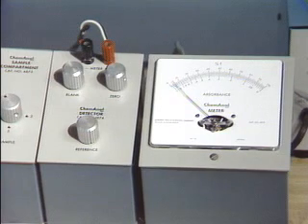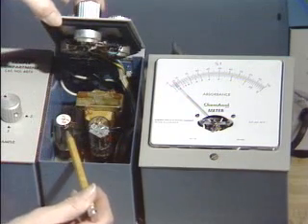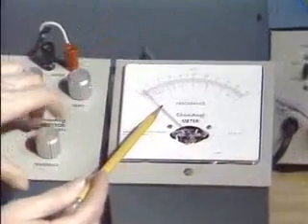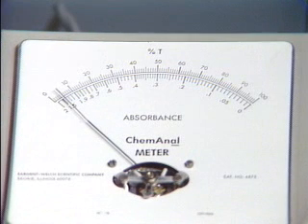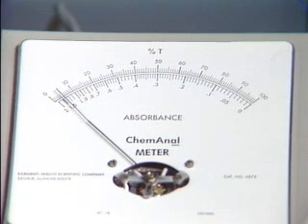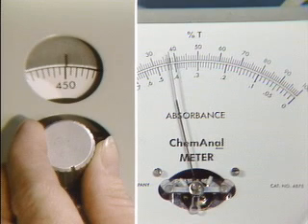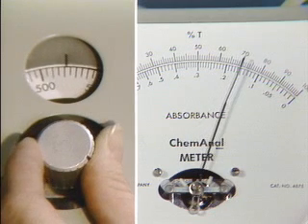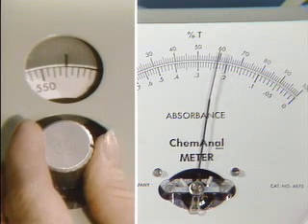The photometer portion of the spectrophotometer consists of a phototube which detects the transmitted light and changes it to a weak electrical signal. The signal is amplified and displayed on a meter, usually marked in both the units of absorbance and percent transmittance. When any light is absorbed by the solution, less is transmitted through the solution and detected by the phototube. That is, as absorbance increases, percent transmittance decreases. By adjusting the wavelengths of light allowed to pass through the slit and the solution, the amount of light absorbed by the solution at each wavelength can be determined. In each solution there is a specific wavelength at which the absorbance is a maximum.